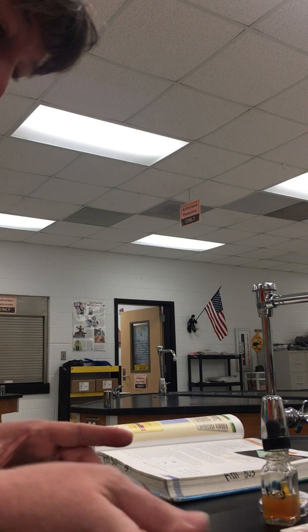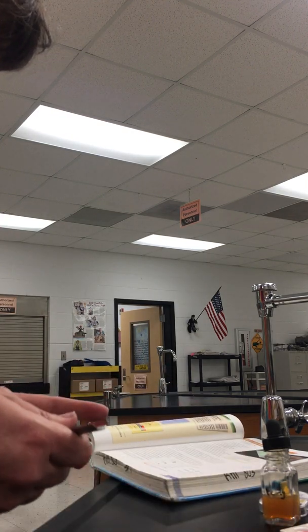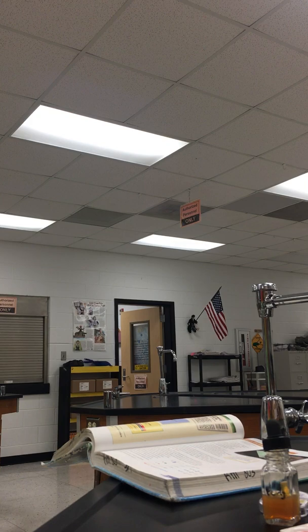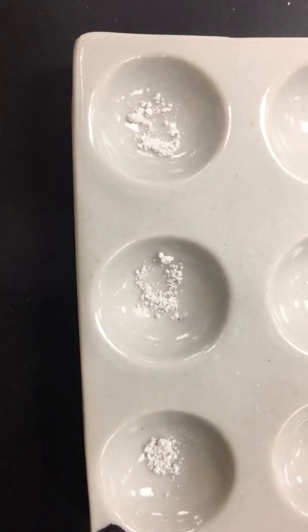So I'm just going to put a small amount of unknown 1 in the bottom well. All right, let's look at the powder first so you can make your hypothesis. This is what it looks like.